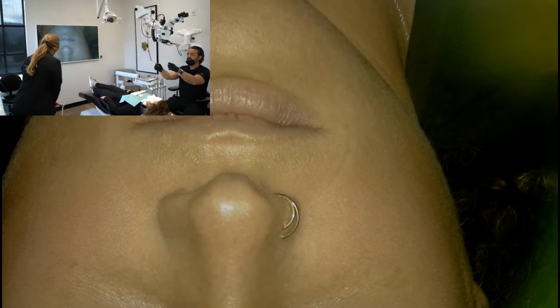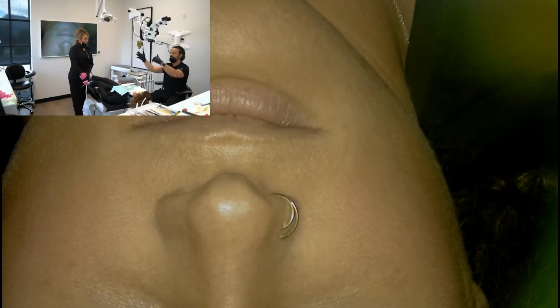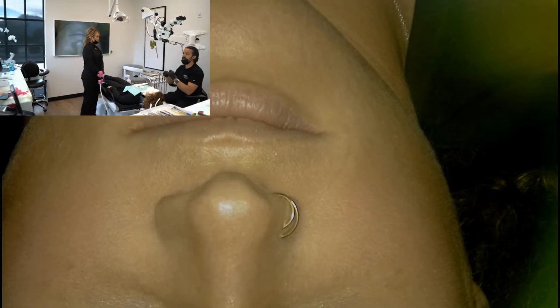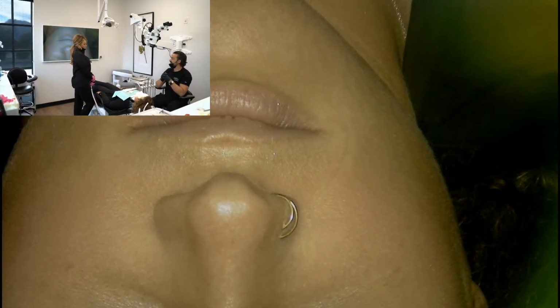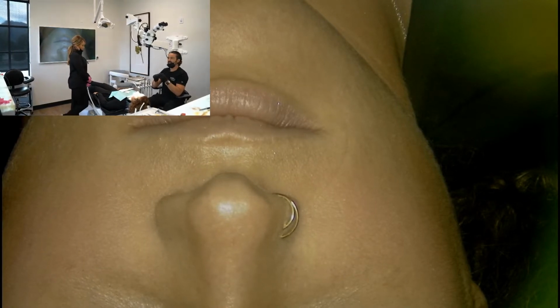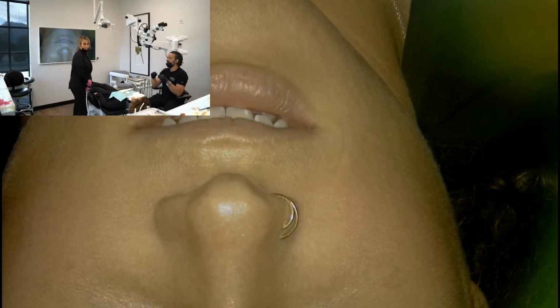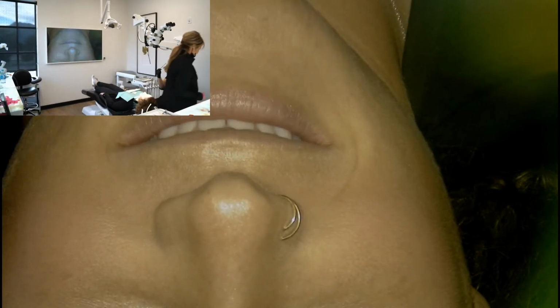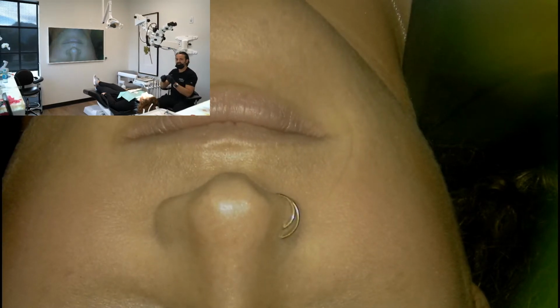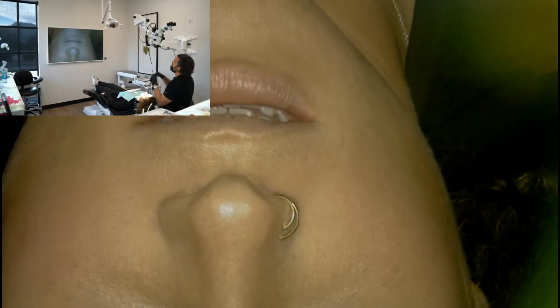Vicki, you're on the cord. I'd put it over on this wall, on my 9 o'clock wall, and I would look at it like this. But if you were interested in not using a microscope, and only using loops, but wanted video documentation, if that's what the question really was about, then you do what I'm doing.